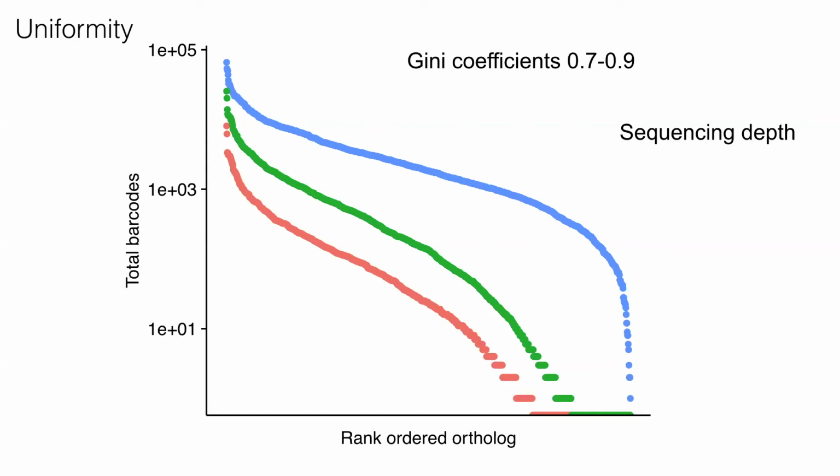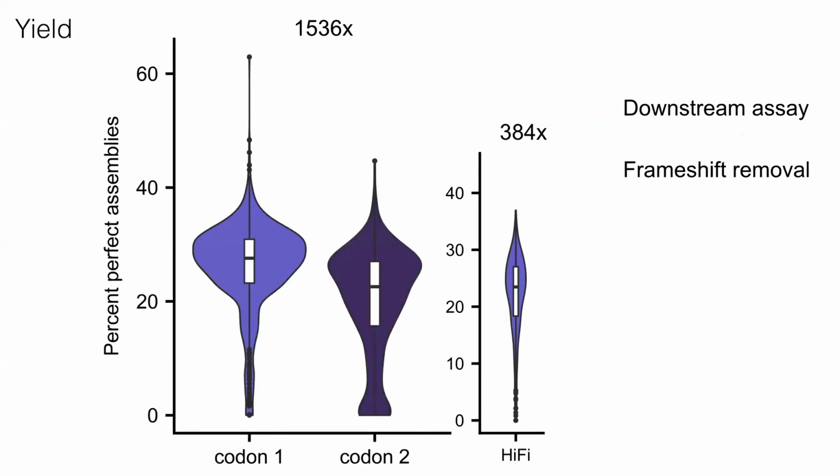And so what we've also seen is that when we've sequenced the oligos straight off the chip and then compared that to the assemblies, there is a very strong correlation between oligos that are very weakly represented at the chip level and their subsequent representation at the assembly level. I should mention that one of the things which also contributes to this skew, which we're investigating, is of course the multiple rounds of PCR amplification that we go through, and we're exploring a number of different options to see how much of an effect that is.